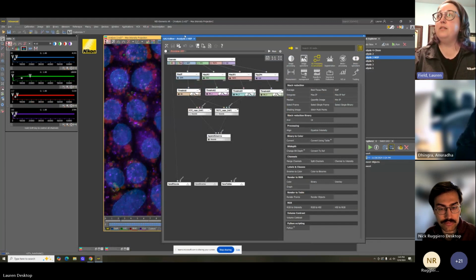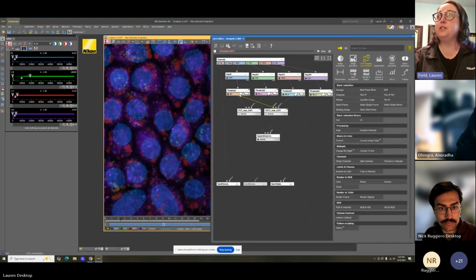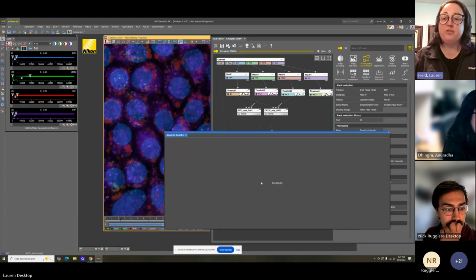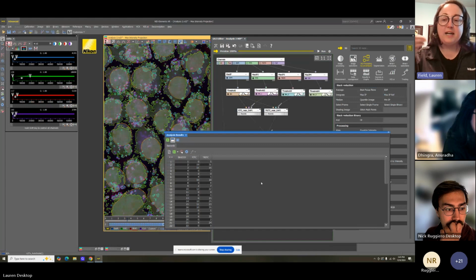Once you've done this maximum intensity projection, you can then threshold on the maximum intensity. And this preview is taking a while. When we move into the volume, I'm going to show you this length of time that it takes to reduce. This is why when I'm doing a lot of this initial analysis, I tend to crop files down so that you have a smaller data set to actively see the preview.